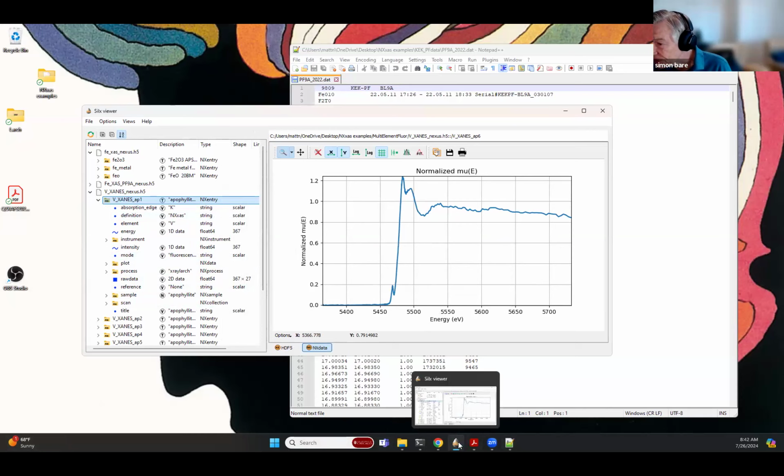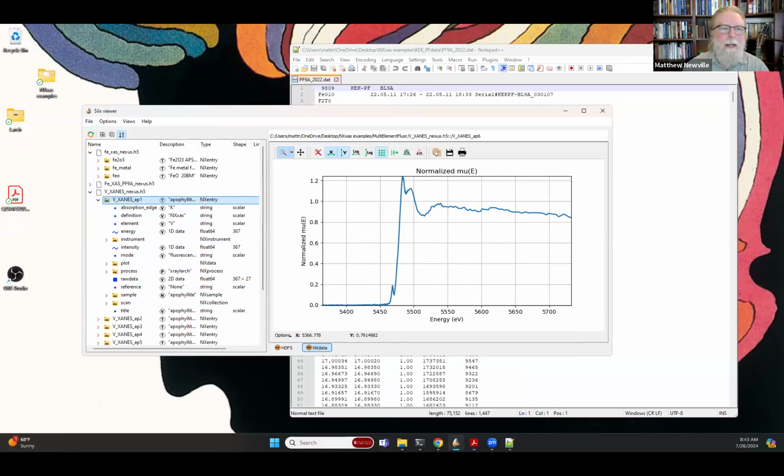Donato, would Nexus also include 2D XAFS maps? I would say that we might want a separate Nexus definition for that. That's worth discussing. Separately, we do X-ray fluorescence and X-ray fluorescence mapping, and trying to get a Nexus definition for that is interesting. I've talked with other Nexus people interested in similar topics like STXM. There is one for STXM, and whether that can be applied for X-ray fluorescence mapping and X-ray absorption mapping is interesting. Handling 2D data sets is worth considering how to do well.